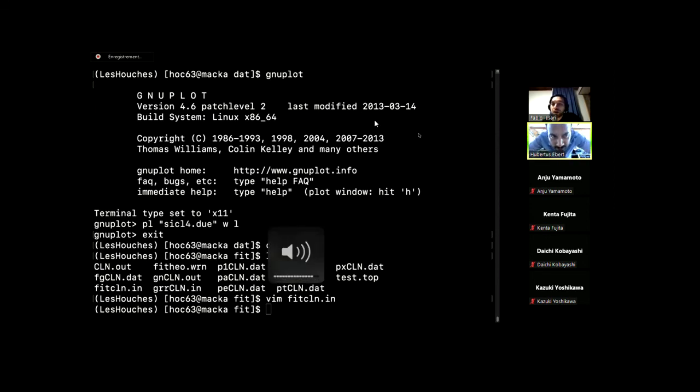Hello, do you hear me? Okay. So in one input file, there is the total contribution for the KH, it's 1. I just wonder, if you want to calculate the contribution for the grazing angle and the normal angle separately, can we do it here? No. Right now, that is not possible. I think it only calculates the total ones.